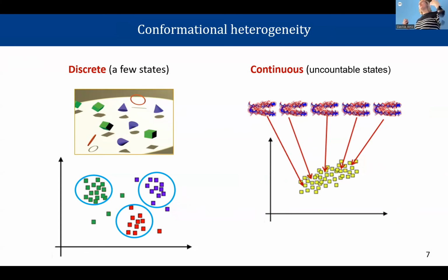So you can imagine that what we want is a little bit not realistic, because what we want is, first of all, to get a full conformational space, not only a representation like this, but also then to prove that we really have different conformations, by getting 3D reconstructions from different regions of this space.